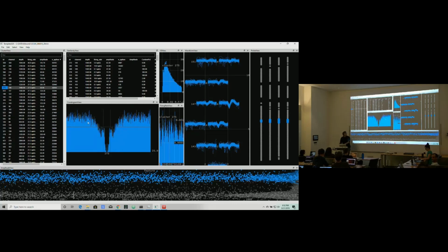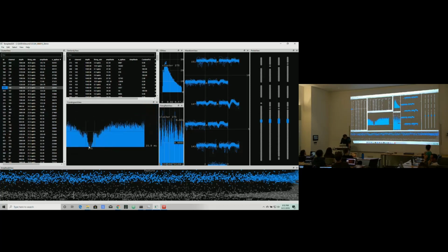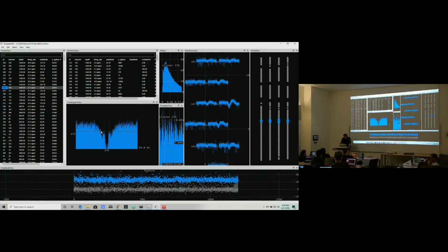There are these new guidelines on these plots that are supposed to tell you roughly where you should expect the refractory period to be, because they're at plus minus 2 milliseconds here. And so this neuron, it kind of drops down. There's some contamination maybe down here, but it's a little bit hard to tell how well isolated this neuron is. So in that case, maybe we want to look elsewhere.